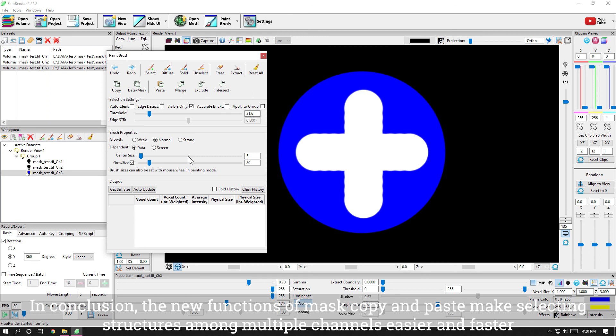In conclusion, the new functions of mask copy and paste make selecting structures among multiple channels easier and faster.